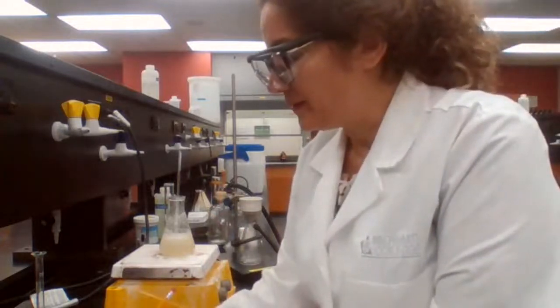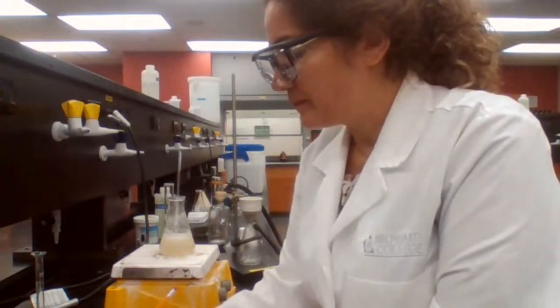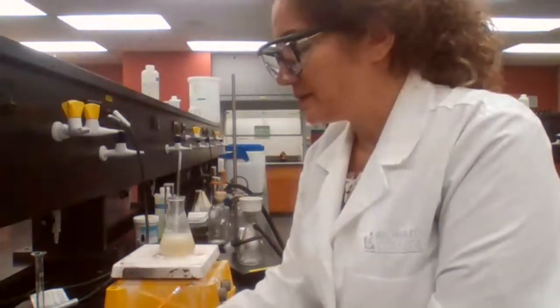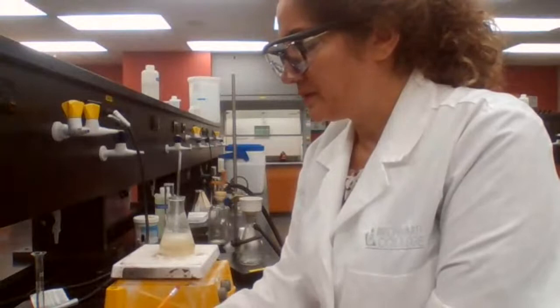This is the filter paper plus the filter paper plus watch glass.